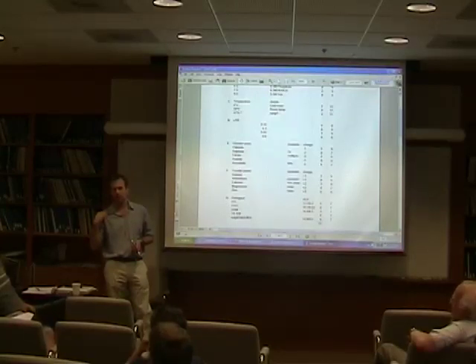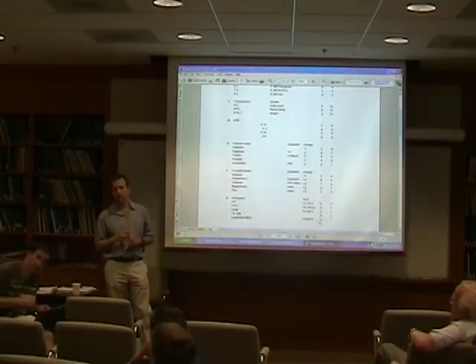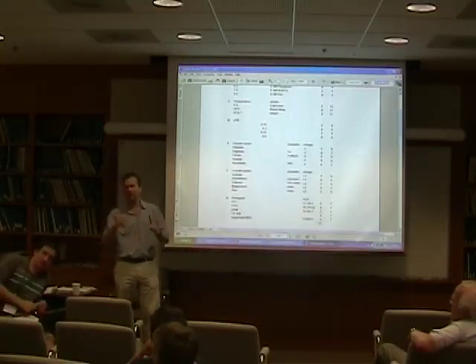You're considering a buffer as a parameter. But also remember that the Hampton screens are the refinement of what Carter proposed. And that's what we need to get to. Right, and we haven't got there.